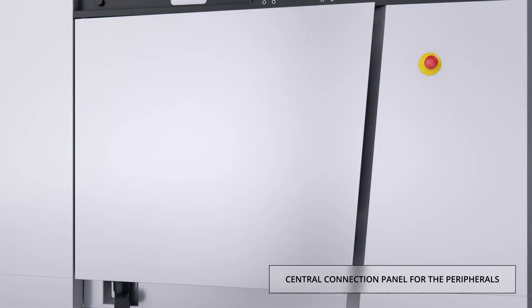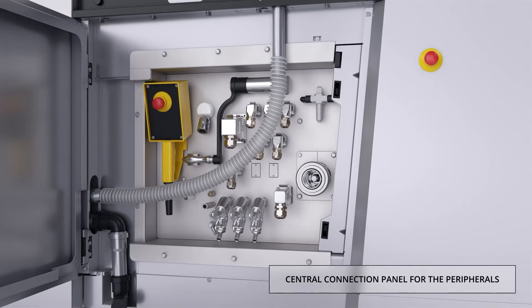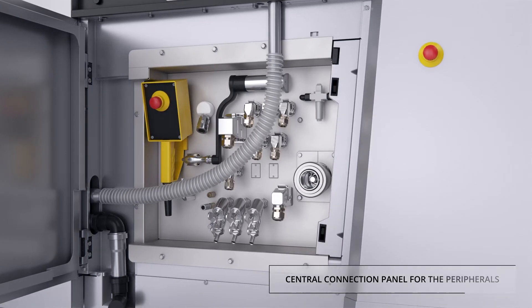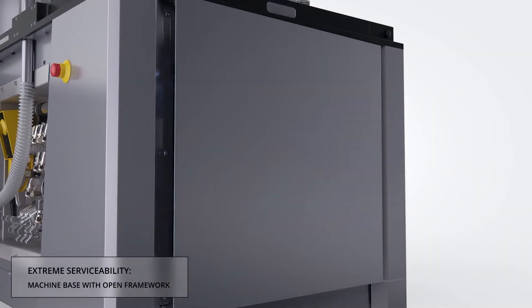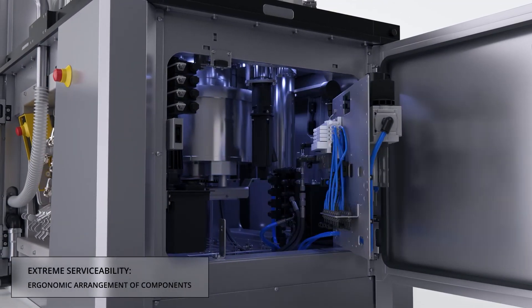An easily accessible central connection panel for peripherals like tablet deduster, metal check, or tablet collection system avoids cables or hoses on the floor. Additionally, the components that need to be serviced are ergonomically placed at the front of the access panels.